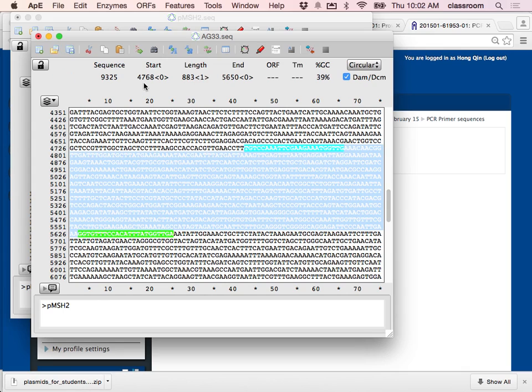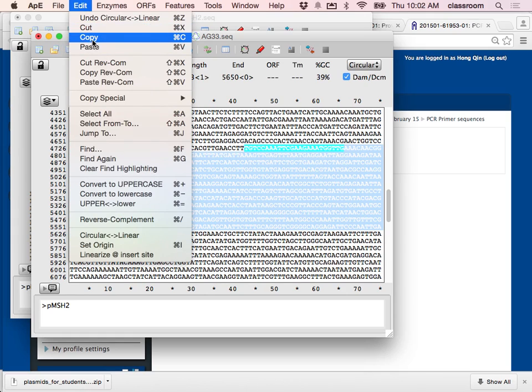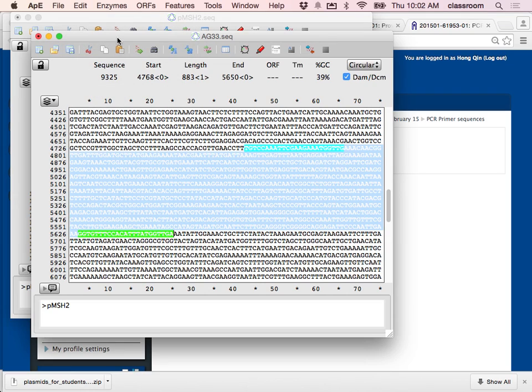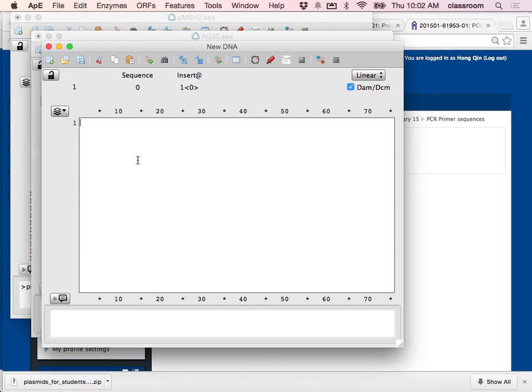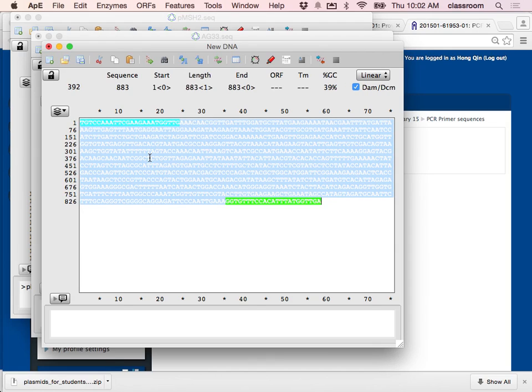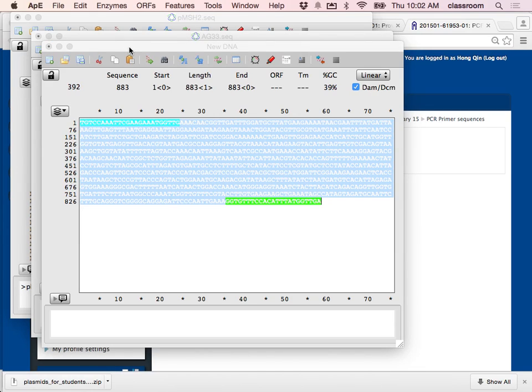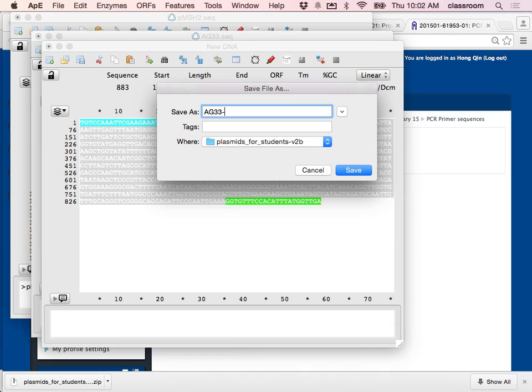This pair of primers gives you an 883 base pair product. The question also asks: if we use a restriction enzyme to cut, what do we see between the wild type and mutant? I copy this sequence — remember I'm analyzing the mutant — and create a new file. I paste this and save it as AG33 PCR, noting it is the MSH2 forward and reverse primer PCR product.